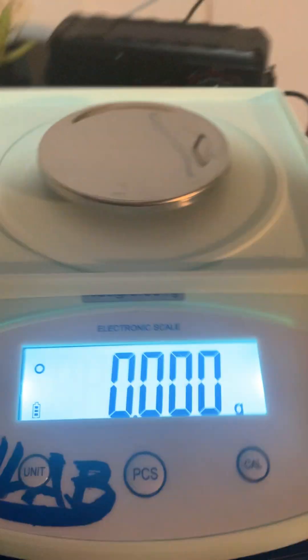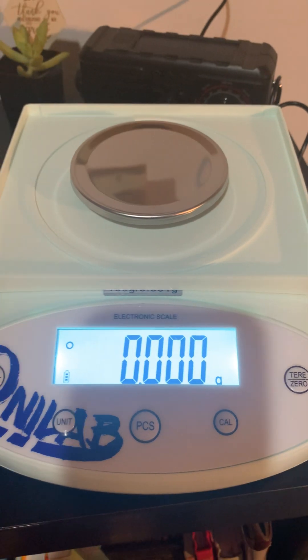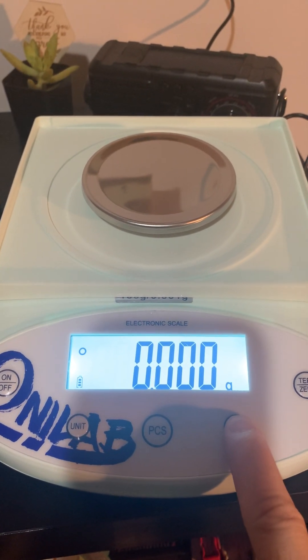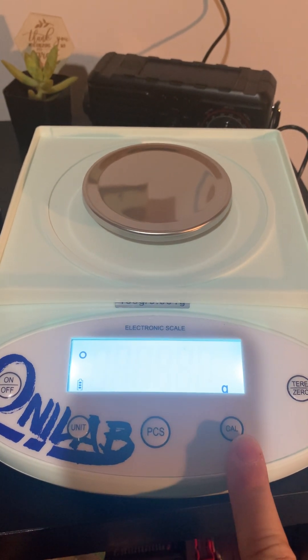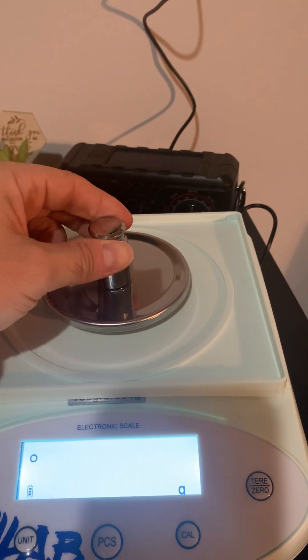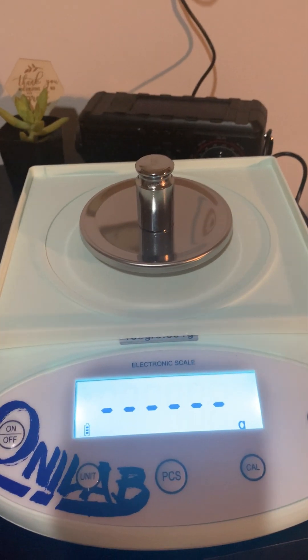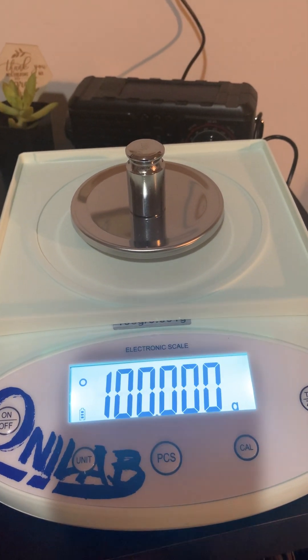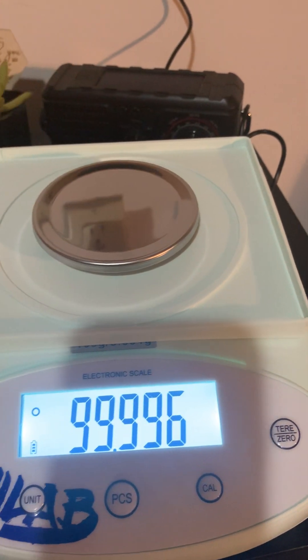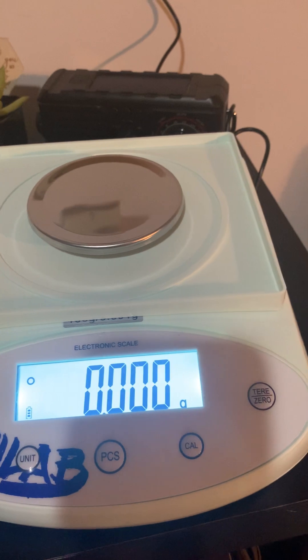Now we're going to calibrate the Onilab. The Onilab has a dedicated calibration button, so we press that. It asks for the 100-gram weight — I'm guessing because it's industrial strength, it can weigh higher weights. You can see it's saying 100 grams, and it's calibrated.